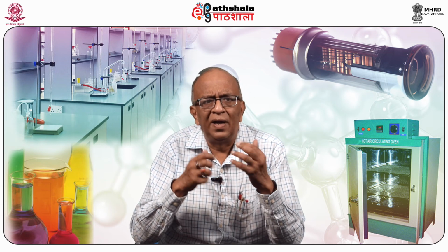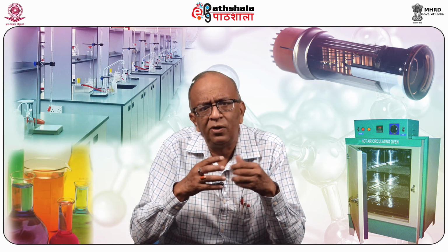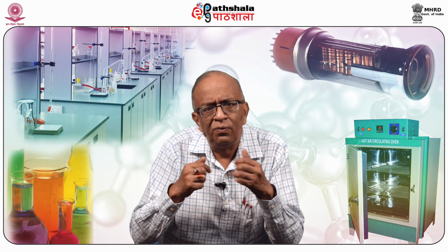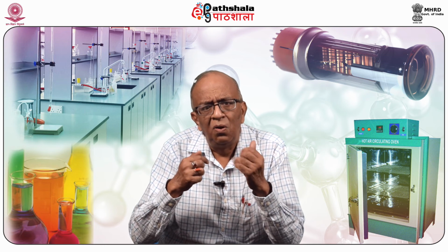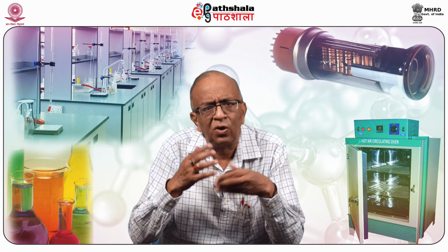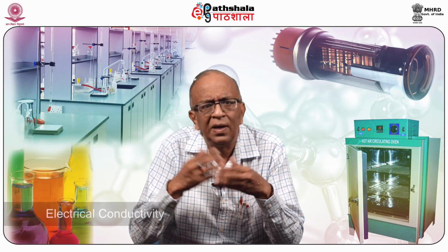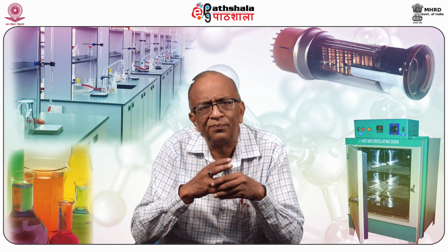Another important analyzer is the oxygen analyzer. The particular method employed depends to a large extent on whether the measurement is for oxygen in the gas phase or for dissolved oxygen, and on the detection limit required. It is based upon the measurement of electrical conductivity, as you can see from the following equation.